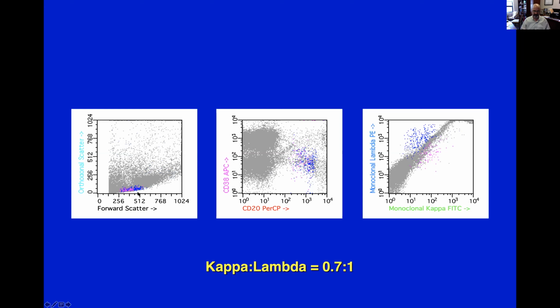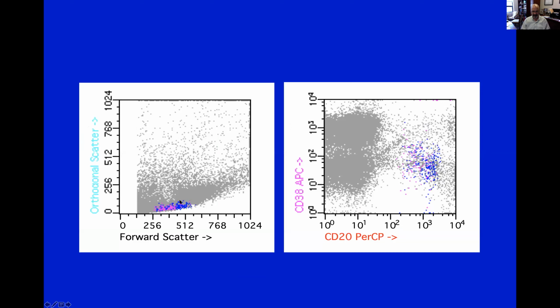But if you look just right, seems like the blue color is preferentially there in this slightly larger part of this size spectrum. Even here, seems like the blue color is more into the CD20 bright. Let's take a closer look here, right? The blue is bleeding more into this larger than the violet is. Same way the blue seems to be brighter. So what we could do is hone in on the population in some different way.